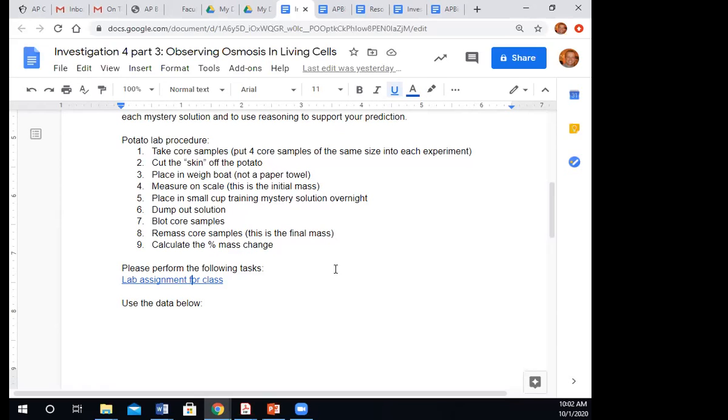Okay, you guys at home, hang tight for 1 second. So, had we been in groups, what you would do is you'd take your tuber of your choice. So you have like, I don't know, a russet or a sweet potato, and you would take these cork borers and drive them into your potato. So it's really fun and cathartic to stab your potato and produce a little core sample.